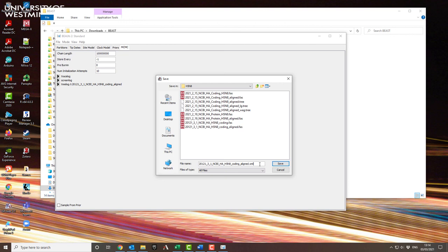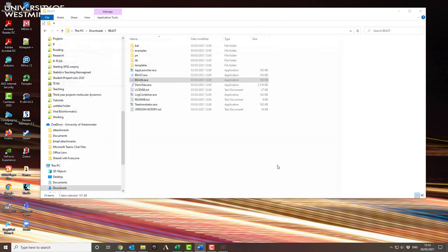BEAUti is the thing that sets up all of the calculation. This is the complicated part, the part where there's lots of different variables and lots of different things that you can choose, lots of different options to choose between. Running BEAST itself is an awful lot easier than running BEAUti.